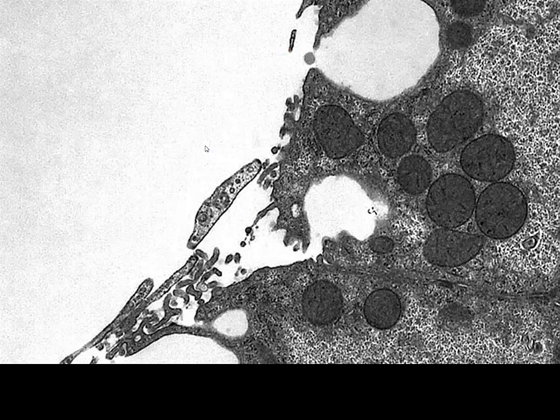Continuing to go up in magnification, we can again see we've got hepatic sinusoid on the left, cytoplasm of our sinusoidal capillary endothelium, space of Disse filled with our hepatocyte microvilli.